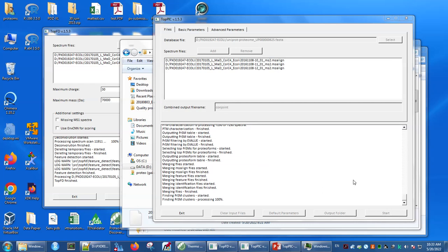So the software will do this clustering in a way that allows us to detect proteoforms in common among the 3 experiments. I think in my experience with the software so far, I've merged up to 18 raw files in a single conjoint assembly. So that's rather useful when you're trying to put together a cumulative report.